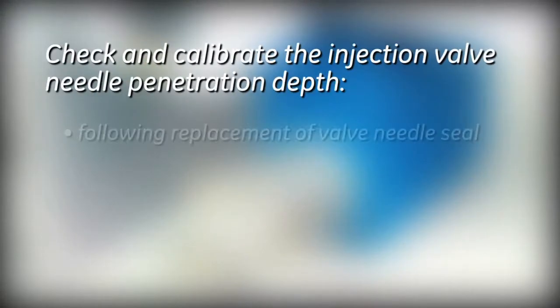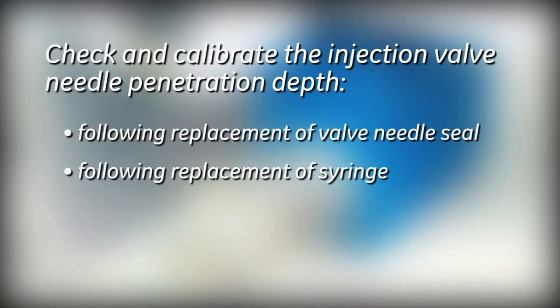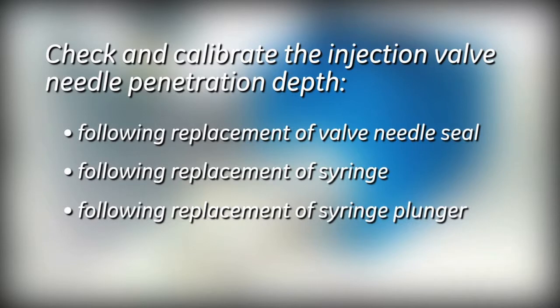Following a replacement of the valve needle seal, replacement of the syringe, or replacement of the syringe plunger on MicroCal VP capillary DSC, the injection valve needle penetration depth should be checked and recalibrated if needed.